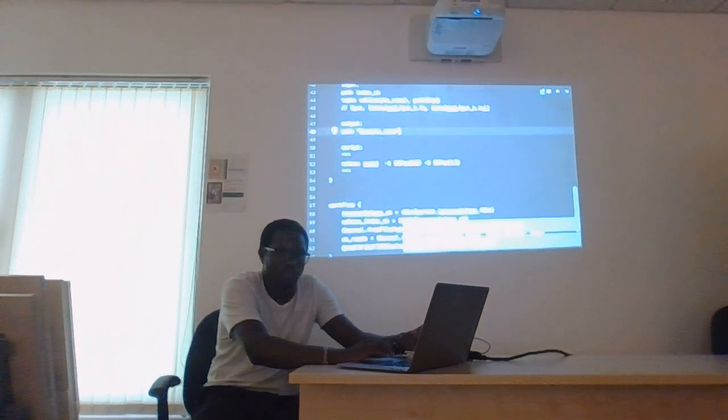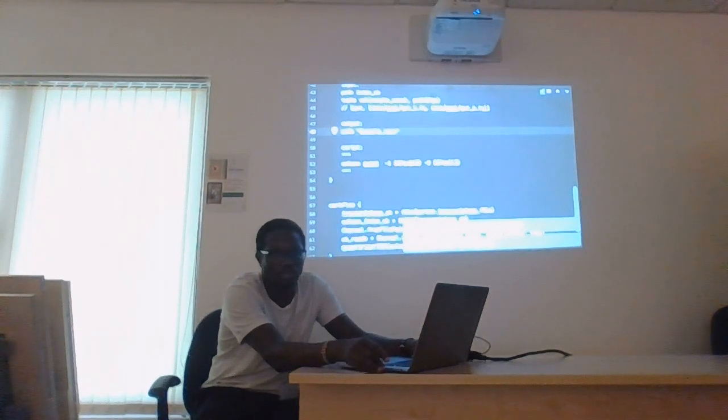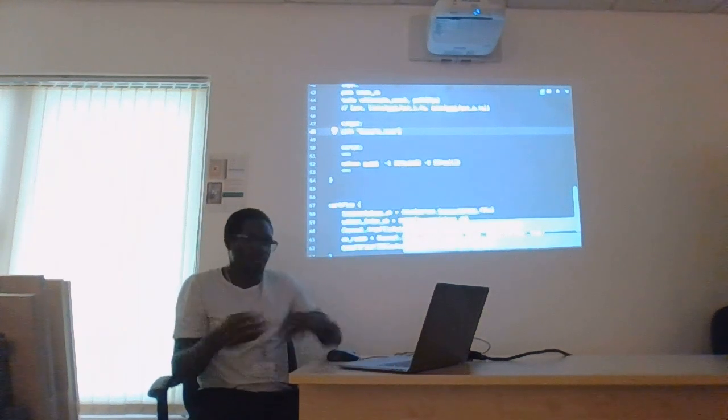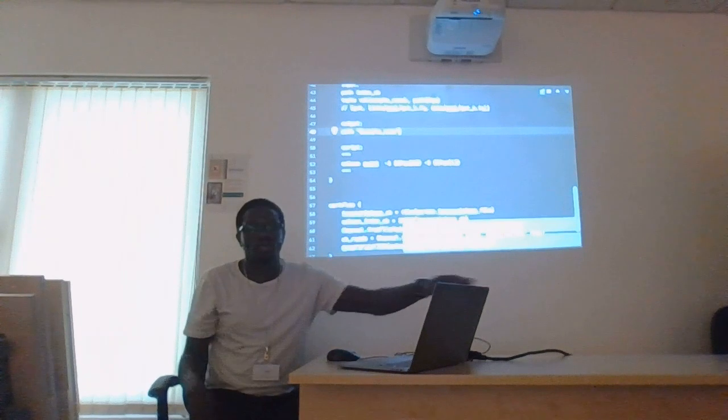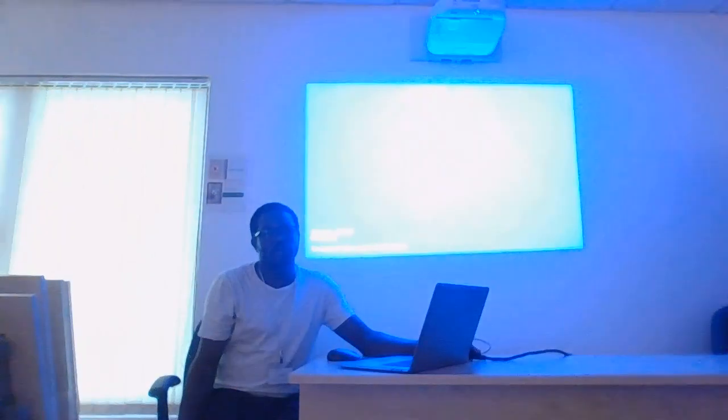This was a simple one. Maybe the next one may be a bit complex. You will see how these channels vary according to the complexity of your workflow or pipelines. Yeah. But just create some time, go through it and see whether you can go to the end. If you have any questions, I'm still available. Yeah.